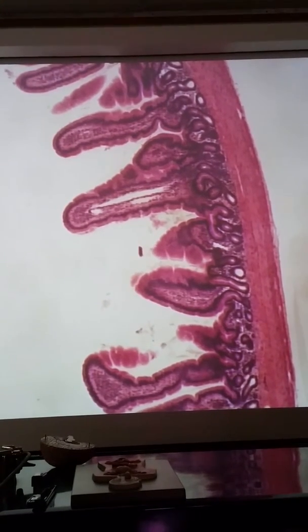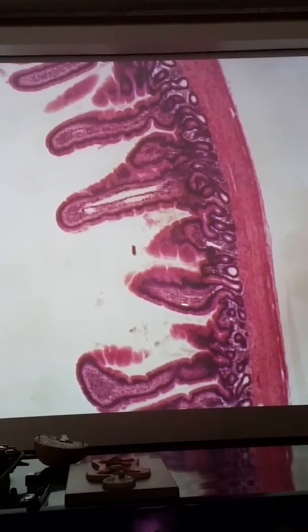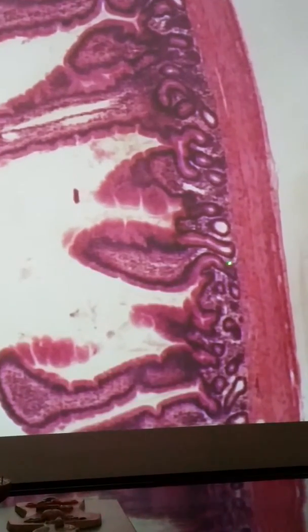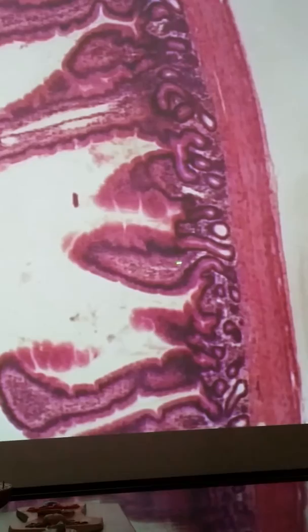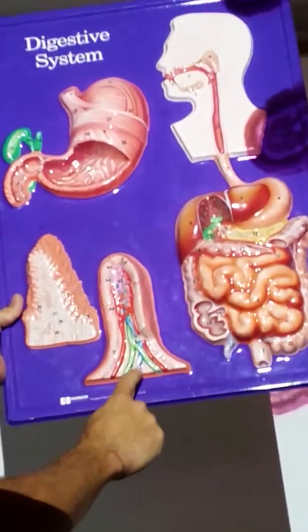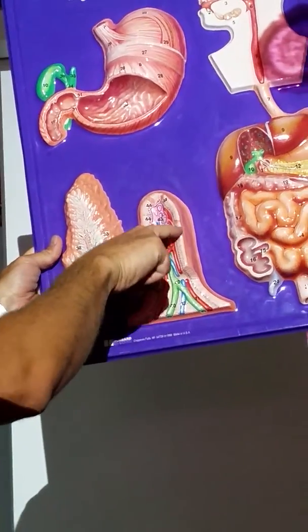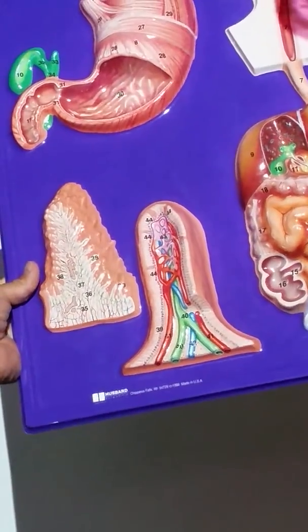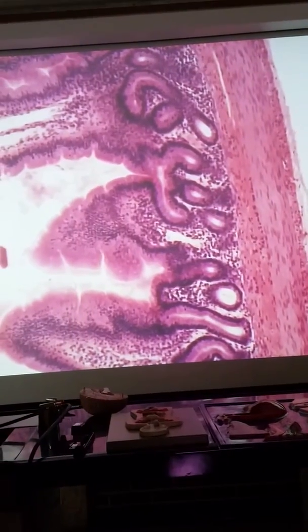Now a lacteal, going up these, here's an individual villus. There's gonna be a space on each side of that, or right down the middle. That's gonna be a lacteal. This part through here is your lacteal. You can see all of our columnar epithelials. You can also see those goblet cells. That's what a lacteal is, at middle of the road magnification.